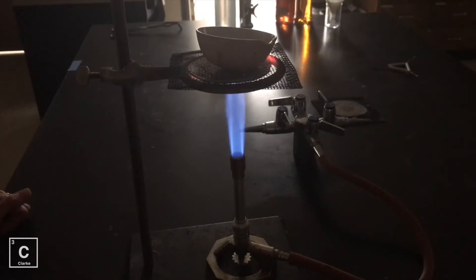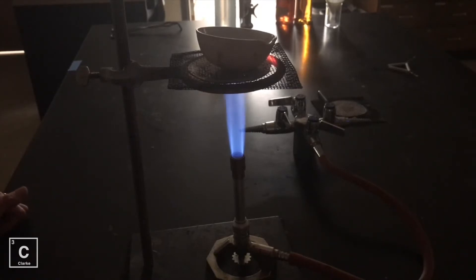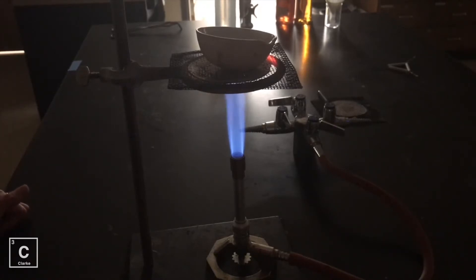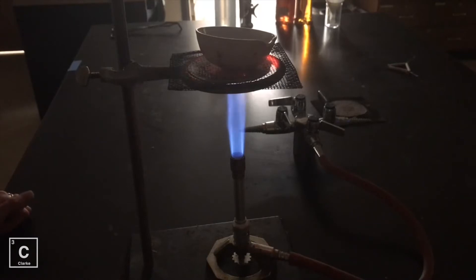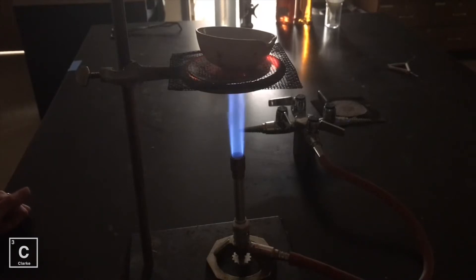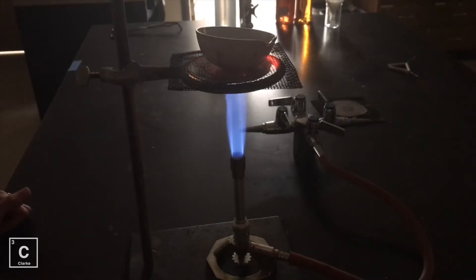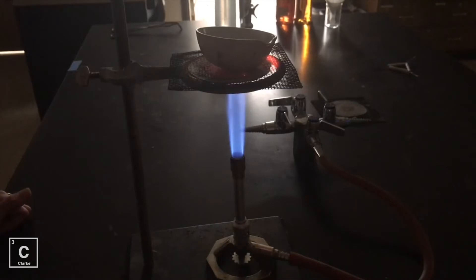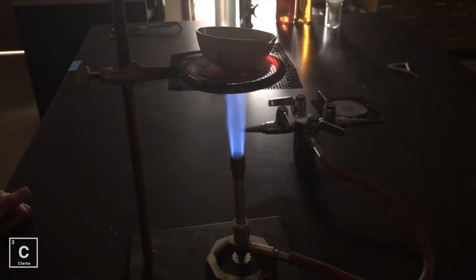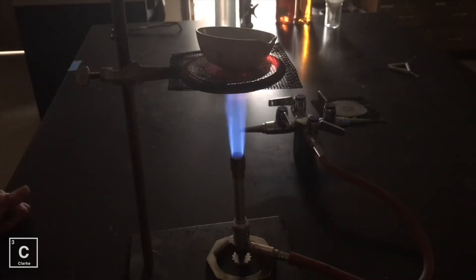Because remember, the top of the inner cone — that is where the hottest part of the fire is. Just be careful when you're using the evaporating dish. When it starts boiling, don't let any of the substance pop out onto you. If that is the case, turn down the heat.